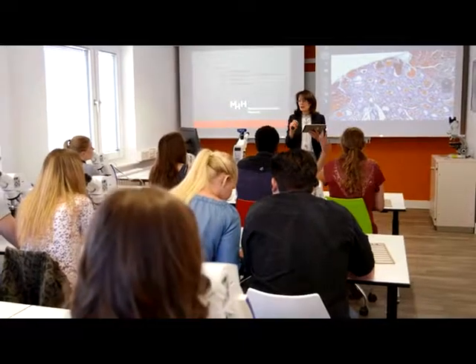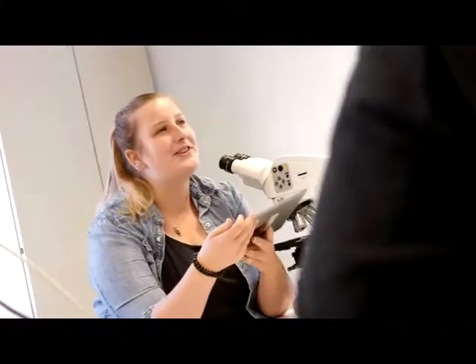Labscope Teacher lets you easily build your classroom, and you can focus on what's most important: teaching.